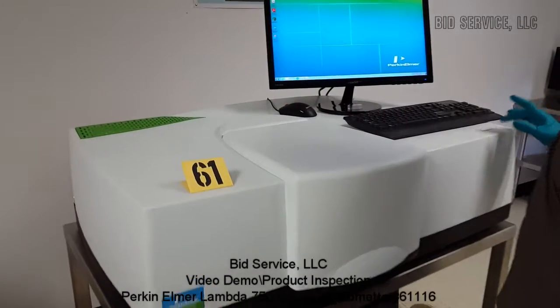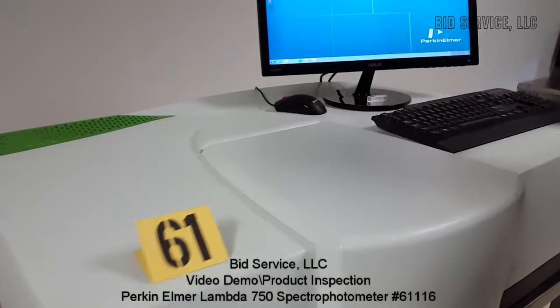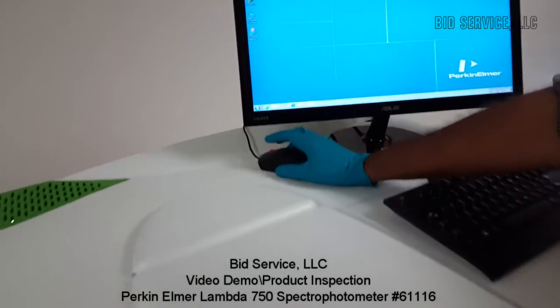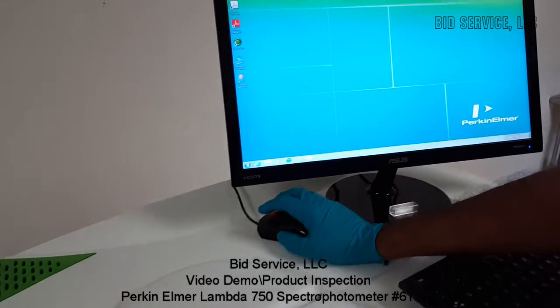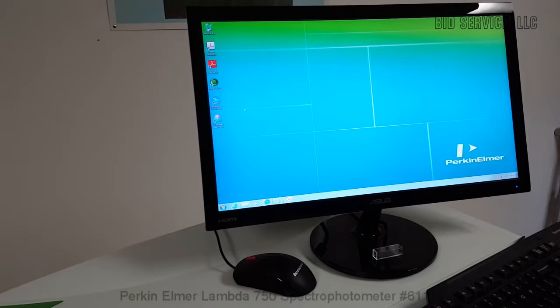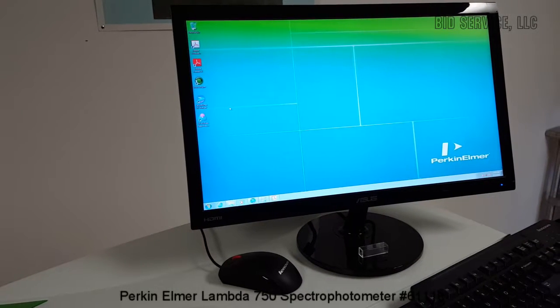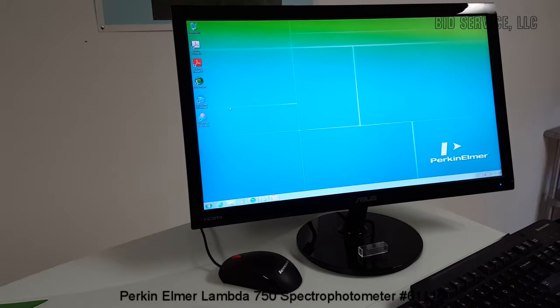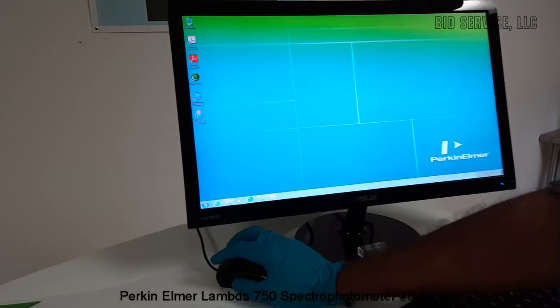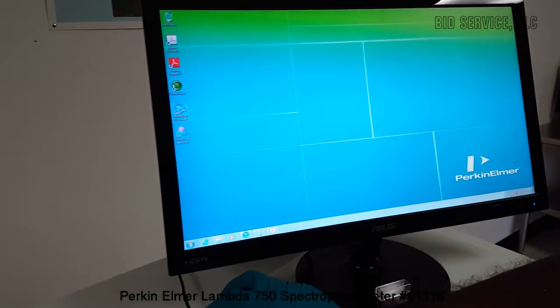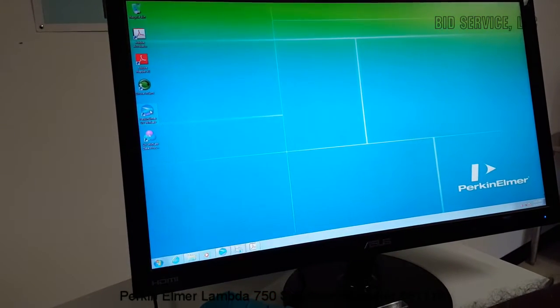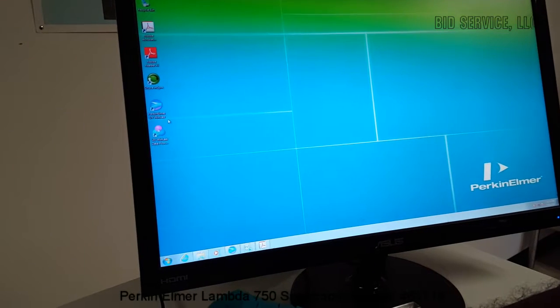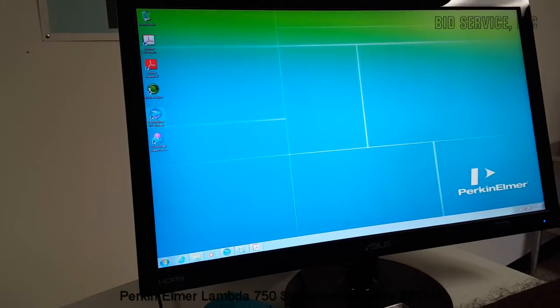Perkin Elmer Lambda 750 spectrophotometer. This system is interfaced to a computer with a Windows 7 operating system on it, and there is an application software that drives the spectrophotometer. It's Perkin Elmer UV WinLab.